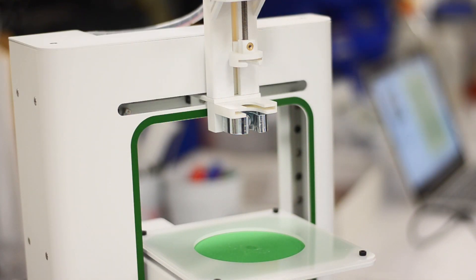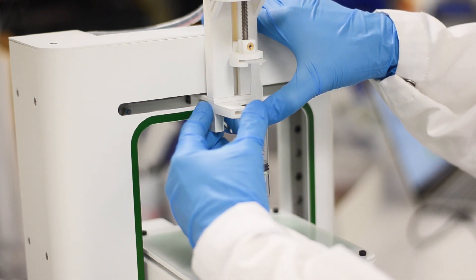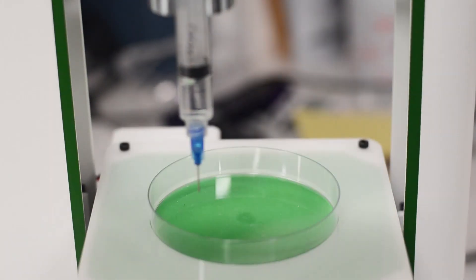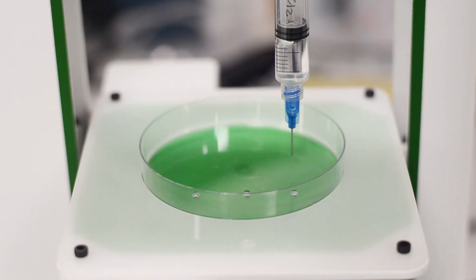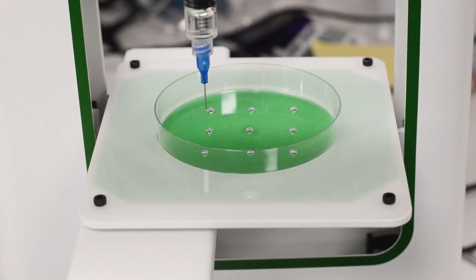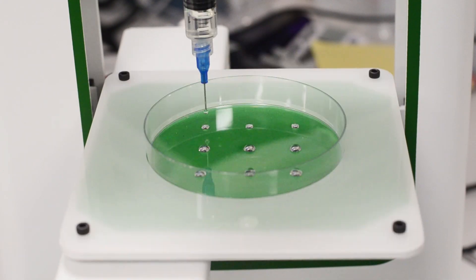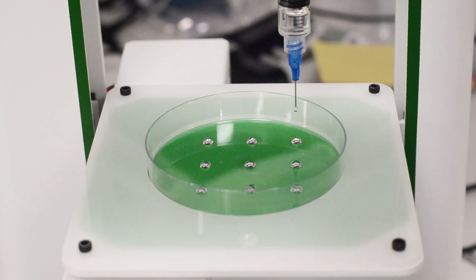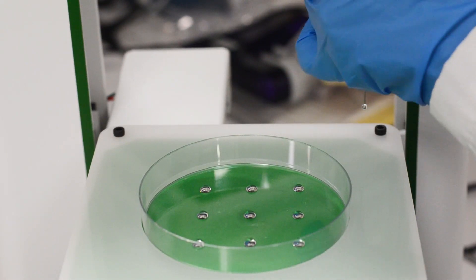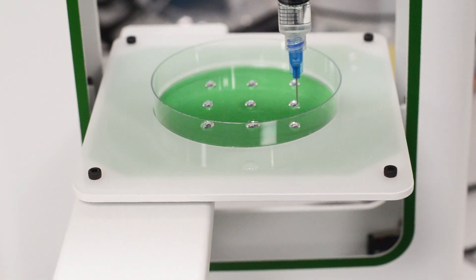To print the enzyme array, first load and print the calcium chloride array. Next, load and print the alginate HRP array. Finally, load the ABTS and hydrogen peroxide syringe and print the array.